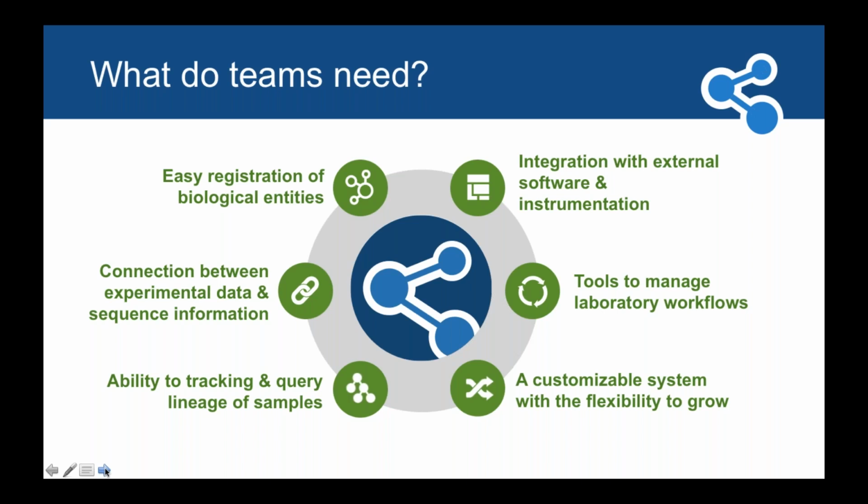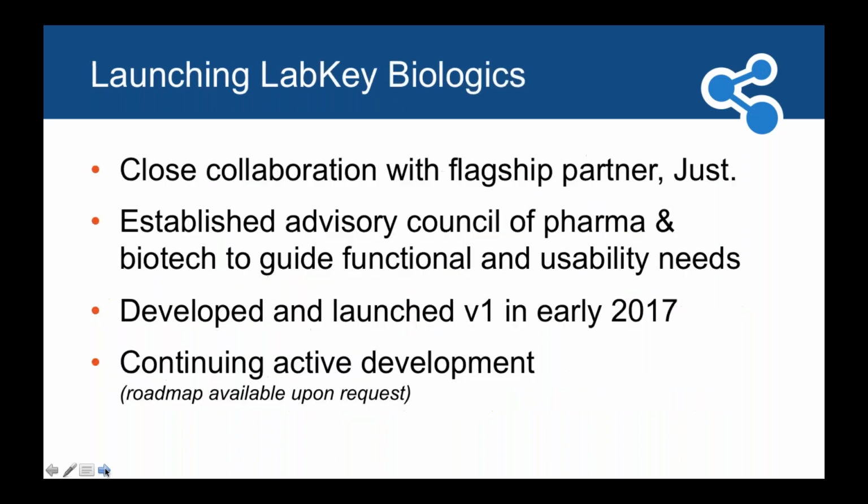And then the final piece is integration with external software and instrumentation. So whether that is a specific analytical instrument, being able to upload directly to LabKey the results of a particular experiment, or other software such as existing registration systems, inventory modules, etc. LabKey, because of its history and because of how it was built, is really able, I guess, to build those types of integrations or foster those types of integrations.